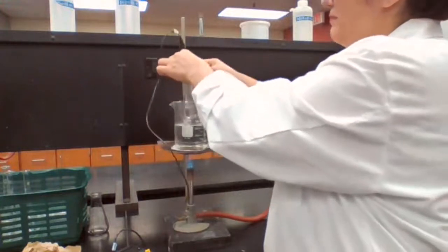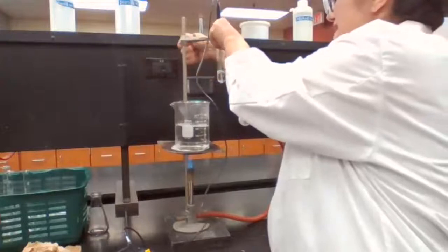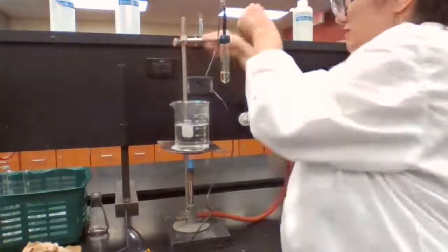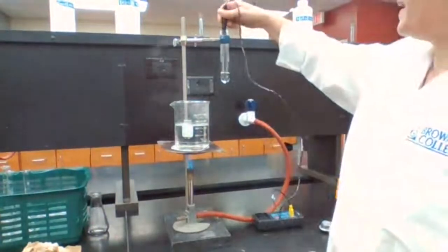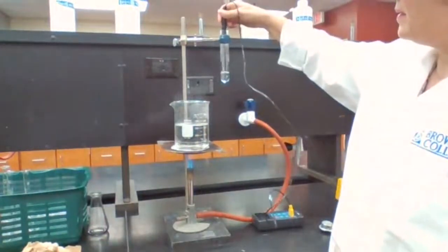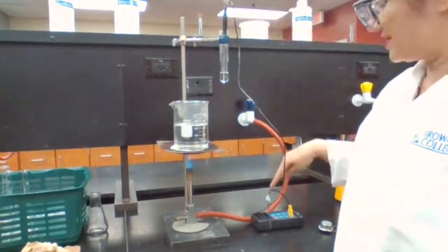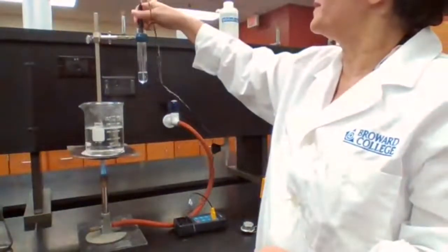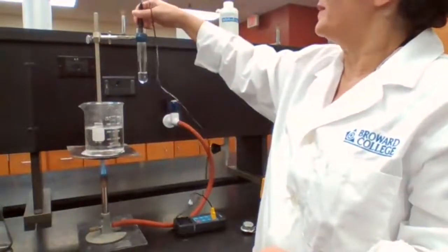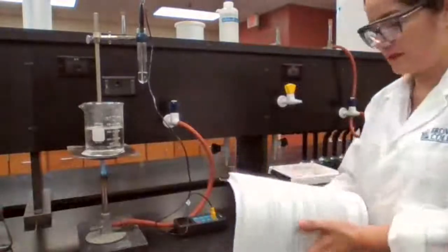So what I do is melt it completely, then let it cool down in order to freeze again. When the temperature stays constant and it reaches a plateau, following the procedure, I can record that temperature as the freezing point of the solvent.